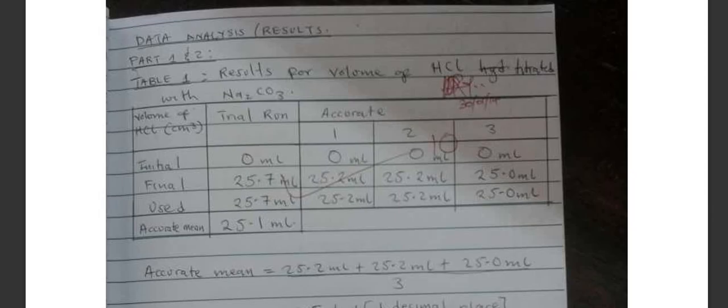So I've done this experiment, this titration. In this case, they were using HCl and sodium carbonate. So they simply reacted the acid and the base, the metal carbonate. They did 3 trials. Of course, you know to say the trial run is never going to be accounted for. We never use it in the calculation of the mean titer, the average. We only focus on the actual trials, because the first one just gives you an approximation for you to know the end point of your experiment. Yeah, so this is what they did. This is what you have.